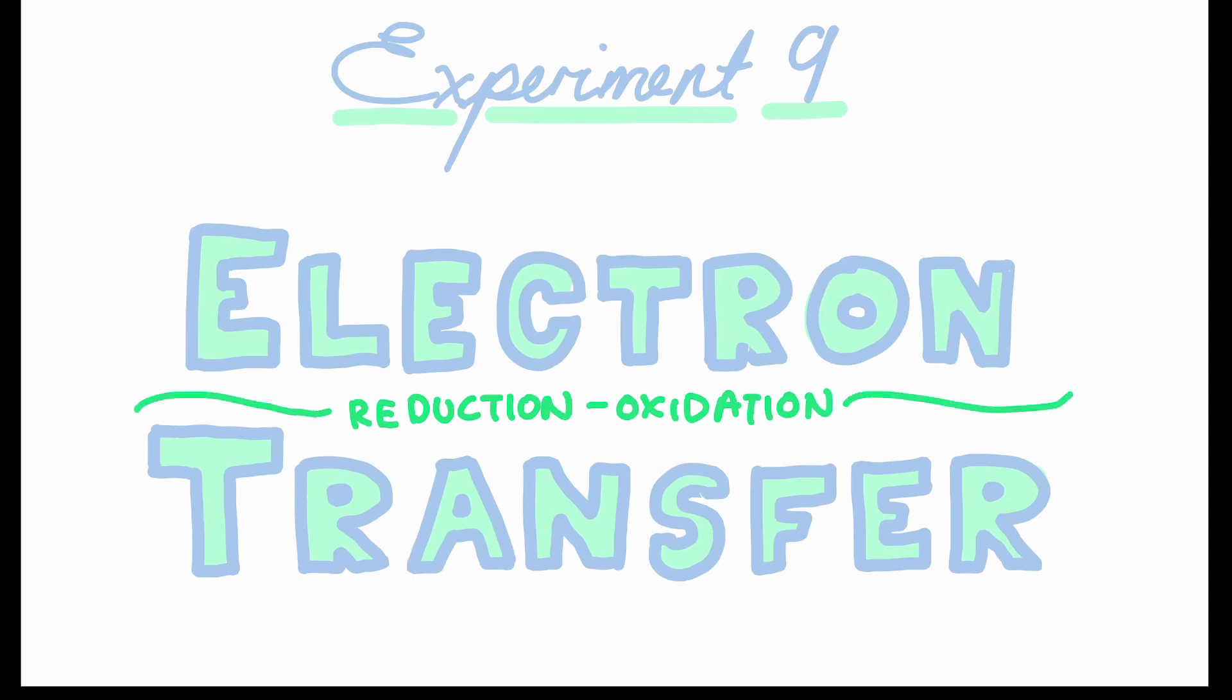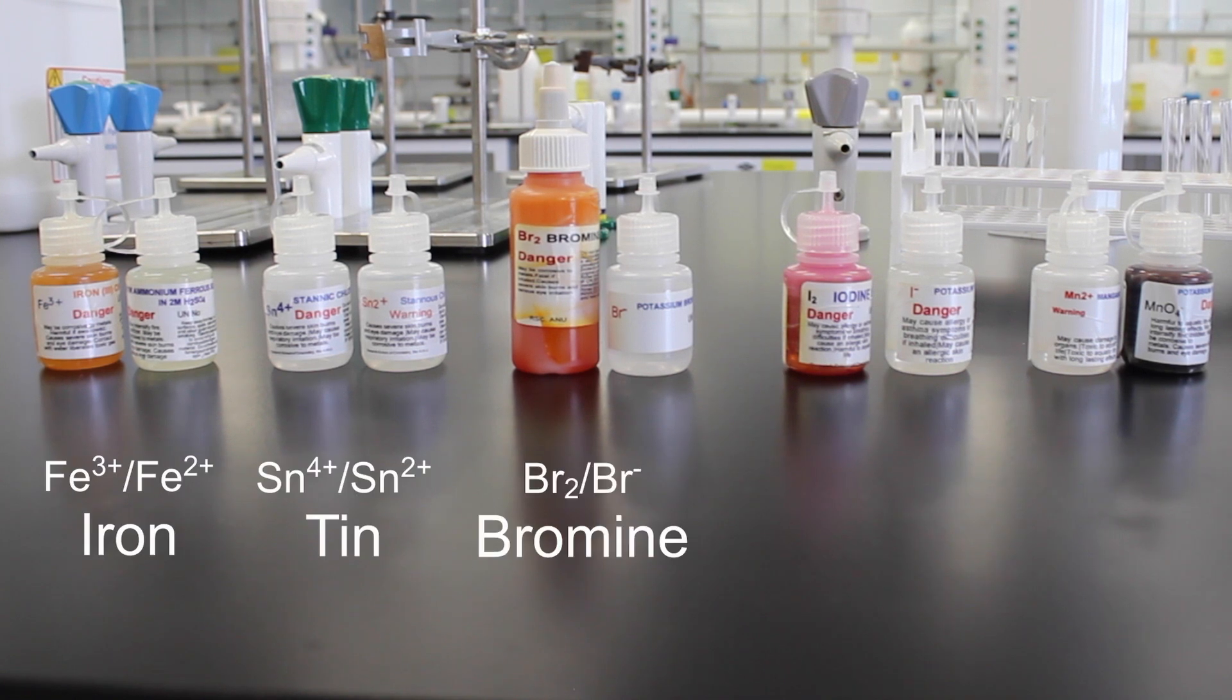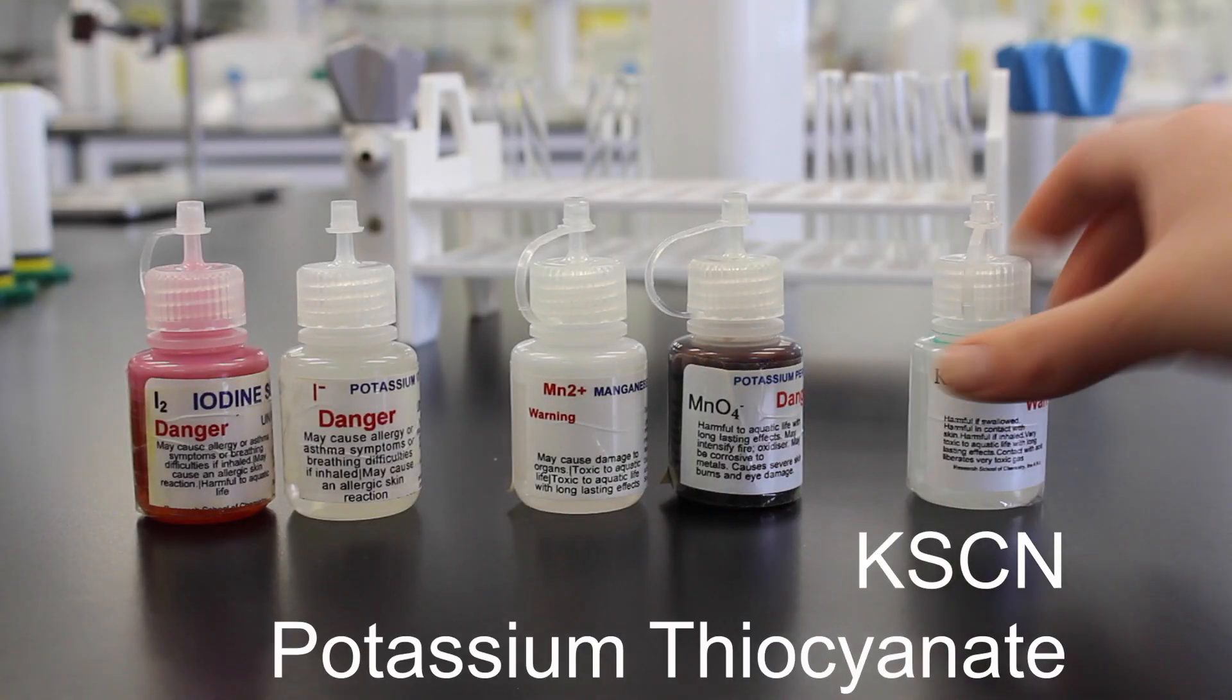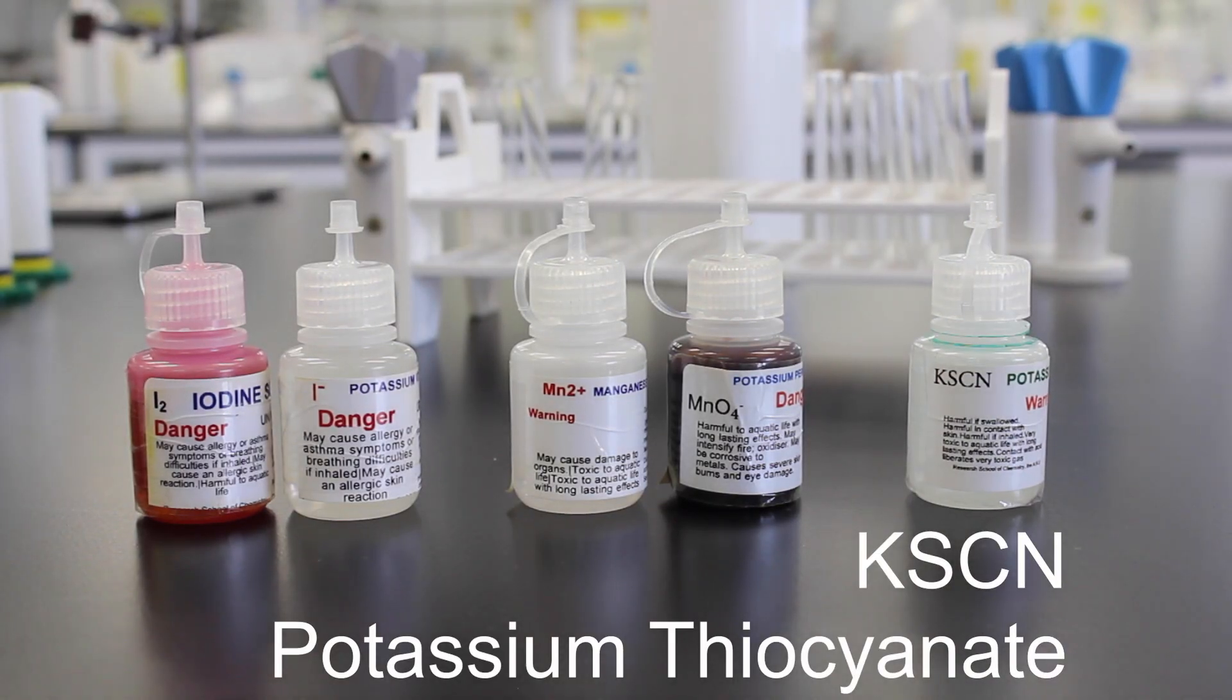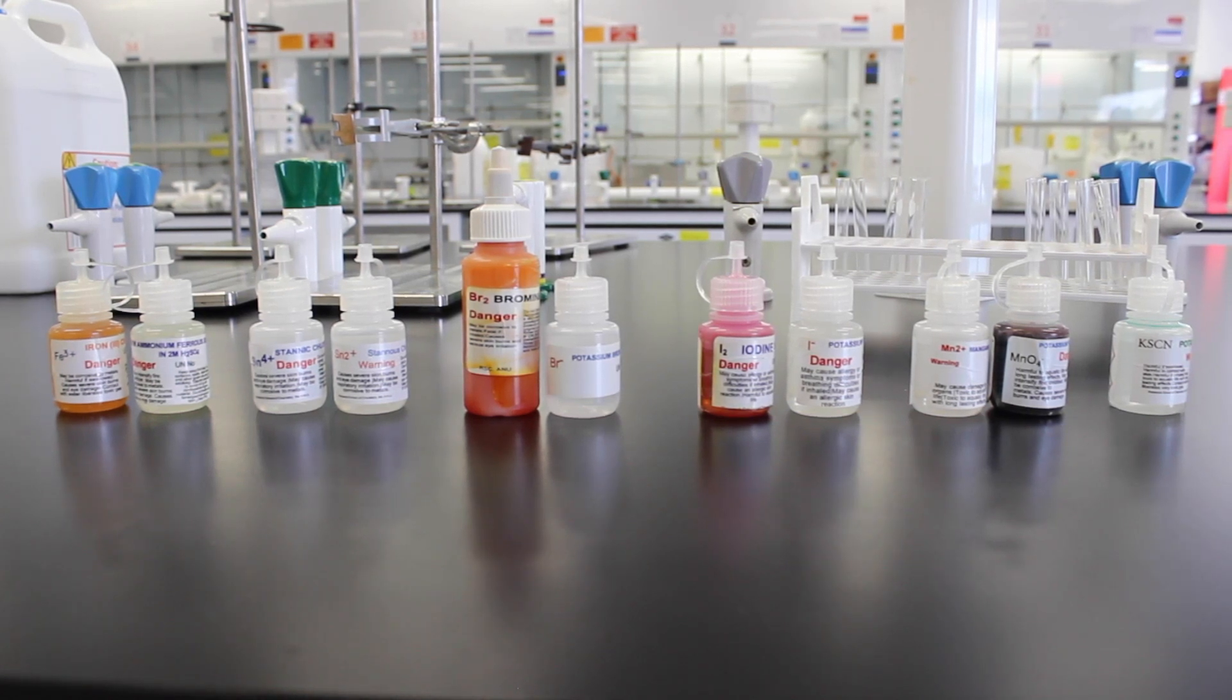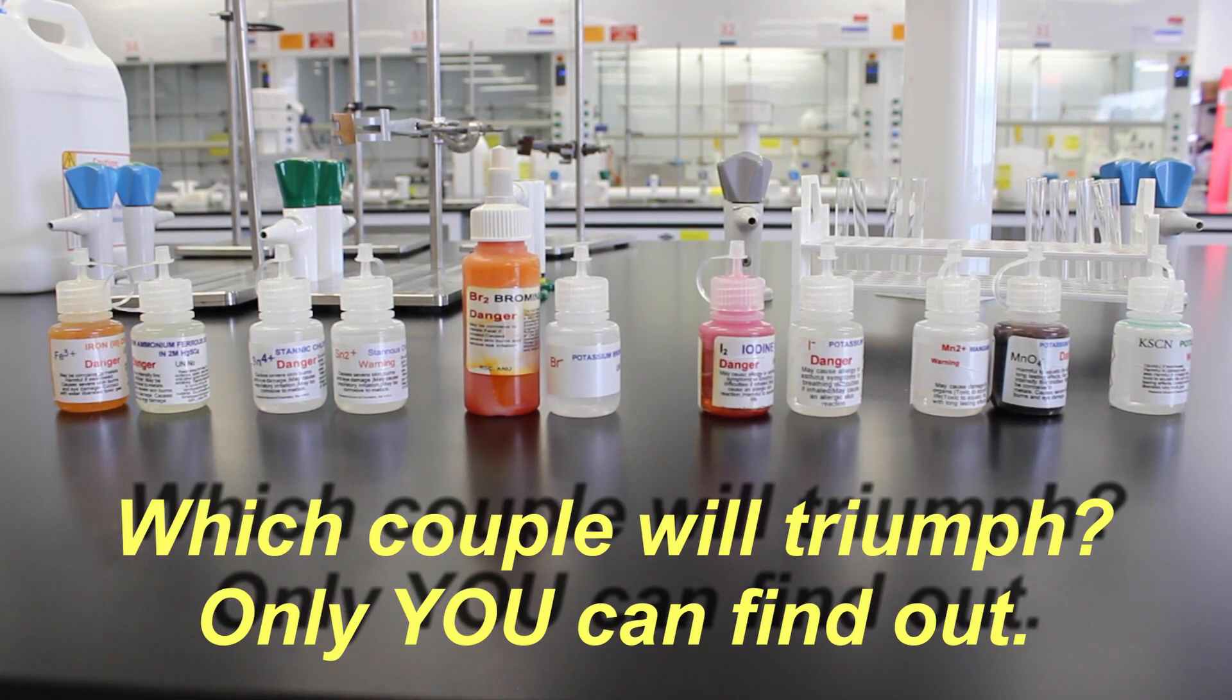The five couples we'll be looking at are for iron, tin, bromine, iodine, and manganese. We'll also be making use of chemical indicators such as potassium thiocyanate to detect species in our reactions and draw conclusions about each of the couple's electrode potential from the results we observe.